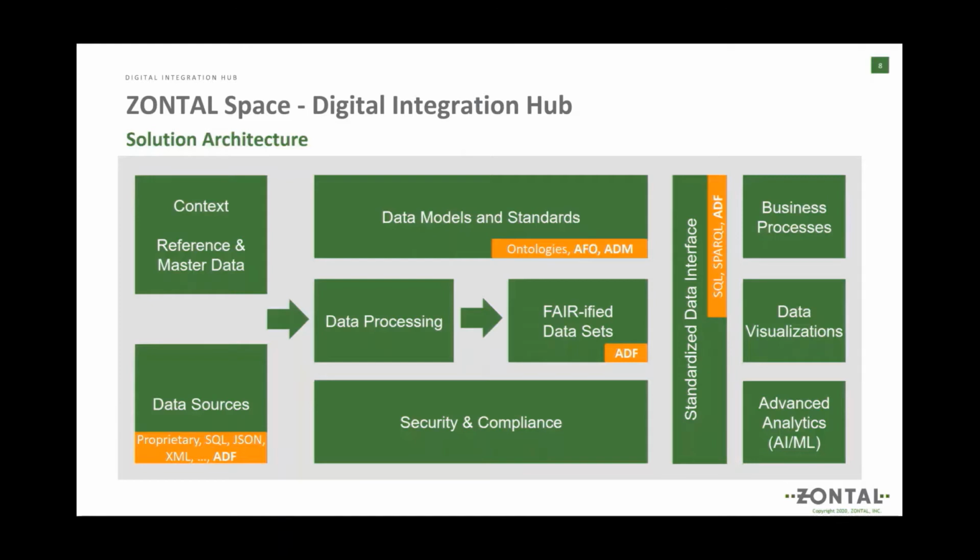Then on the top, we see data models and standards. Here we use different ontologies. For example, we use, of course, some of the Allotrope ontologies, but also we align to IDMP, for example, which is critical in the end, also from the regulatory perspective. And we also create data models here following the Allotrope design patterns.